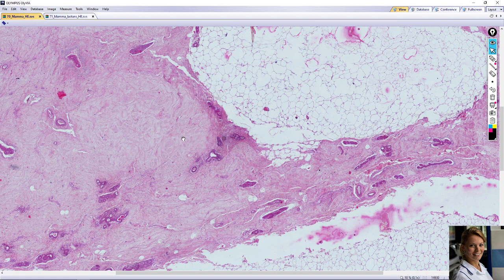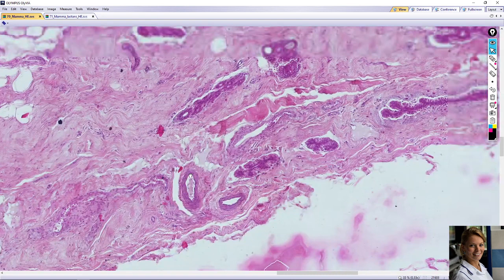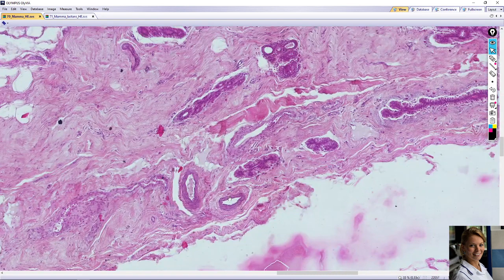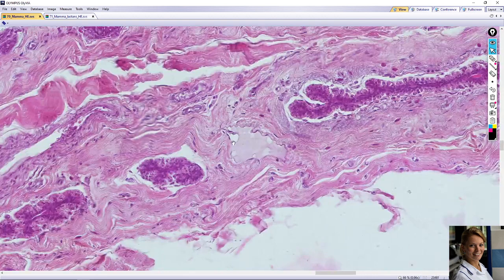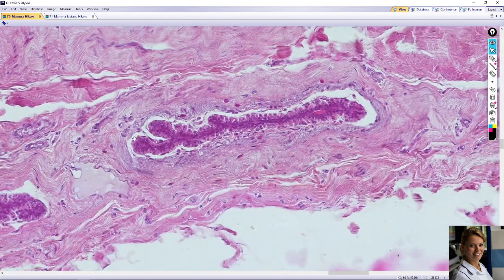The dense interlobular connective tissue contains blood vessels, for example here, sometimes visible lymph vessels here, and interlobular ducts here.